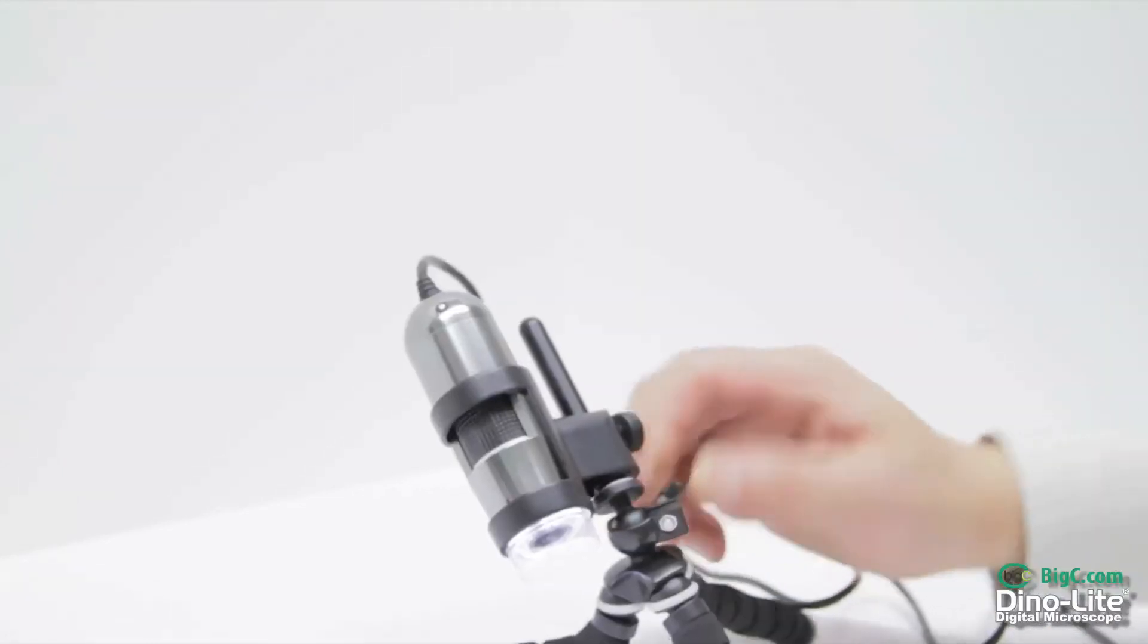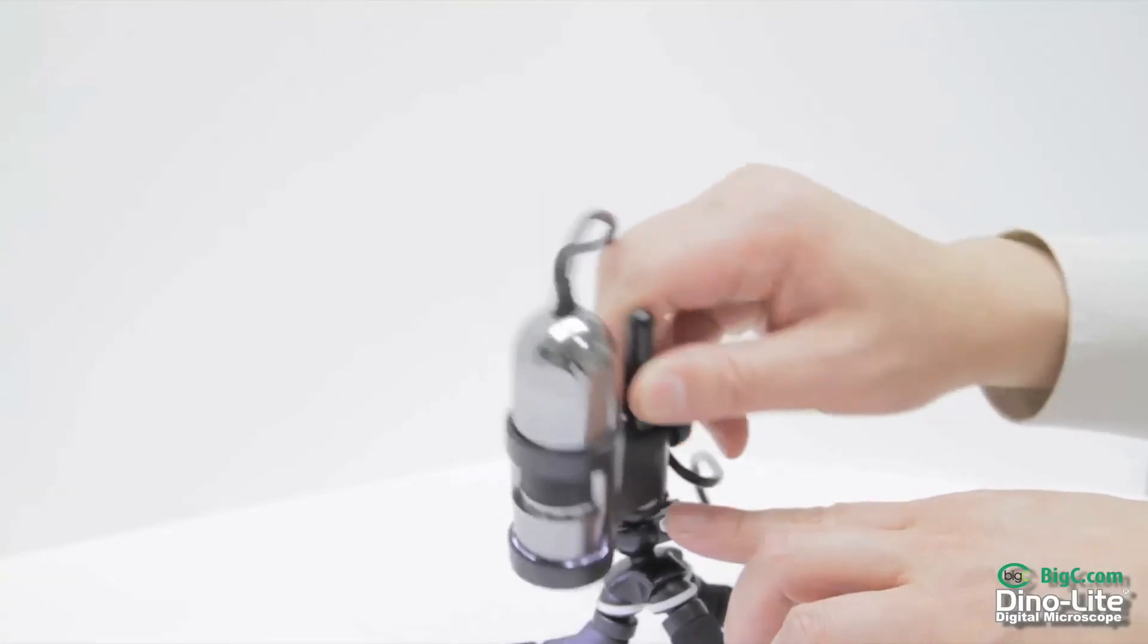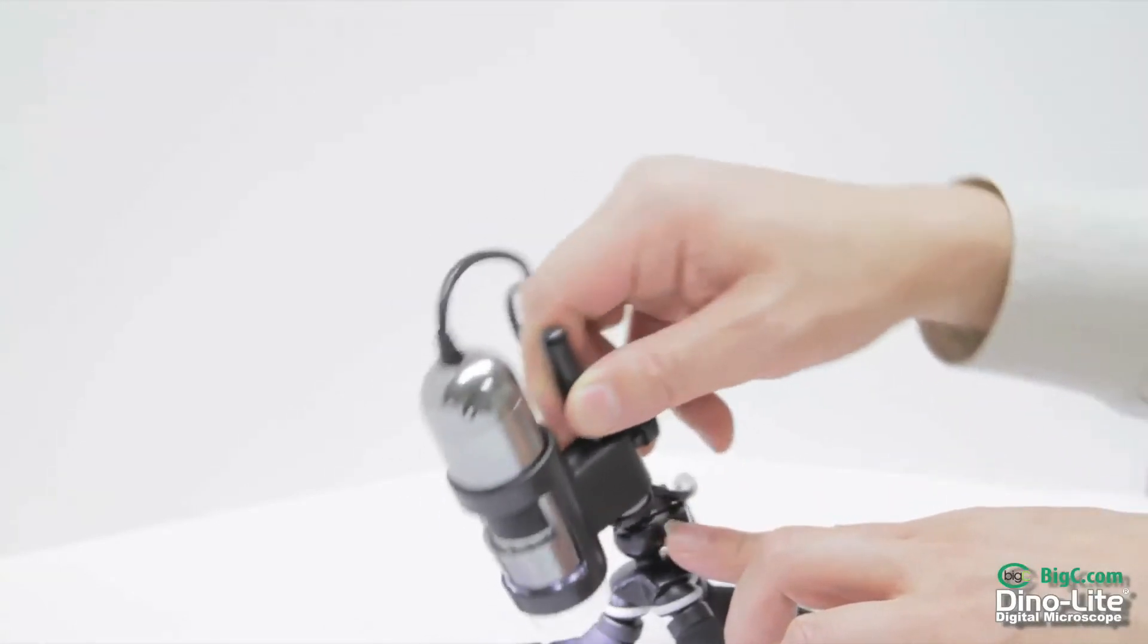By loosening the ball joint clamp, you can achieve different angles. When you have found one that works, tighten the clamp again to lock it into place.